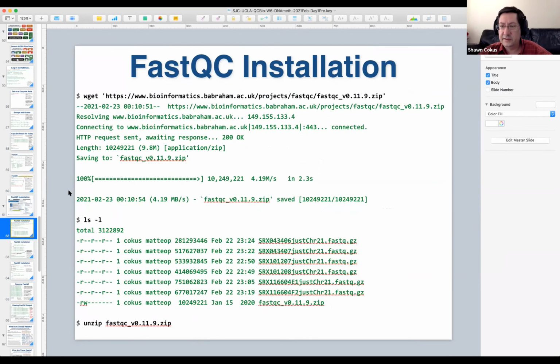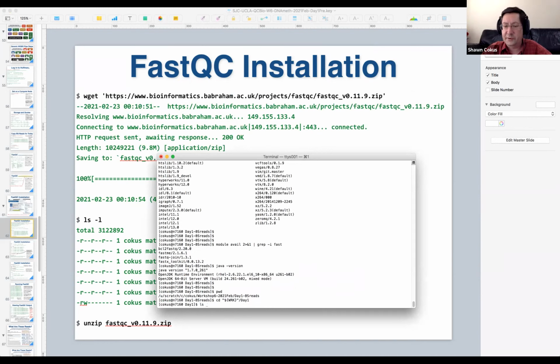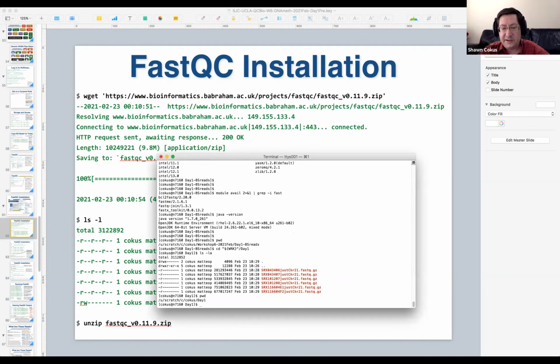So let's actually do the download on Hoffman in the place where we're going to use it. I don't know what directory we're in right now. Maybe you're still in my directory. So anyway, we got to go back to your place. That's the working directory where we're doing all our stuff. Okay, so that's here. I'm now in, you should now be in your equivalent personal place and not my place. So we're back. This is now your copies of the files. You can do anything you want with those. They're independent of my copies now. And we're going to download the Fastqc zip file directly in Hoffman.